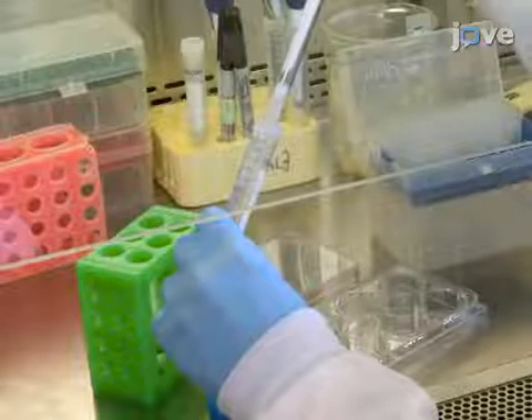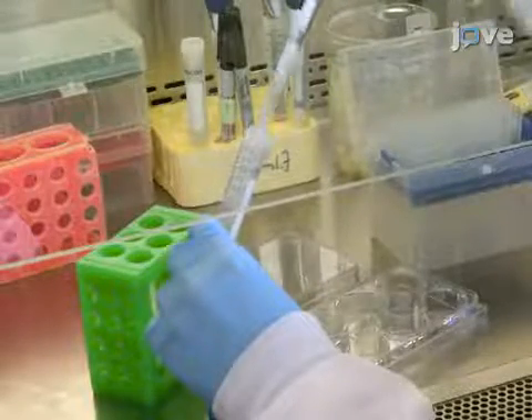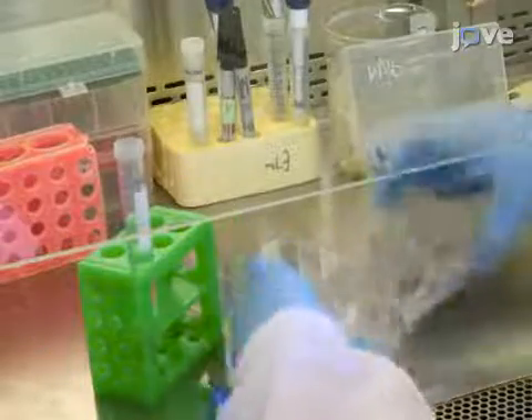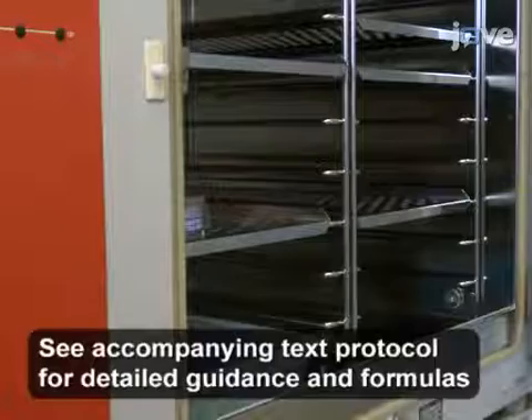On day zero, coat six-well tissue culture plates with 1.5 milliliters per well of anti-human CD3 and anti-human CD28 in PBS with calcium and magnesium for at least two hours at 37 degrees Celsius.